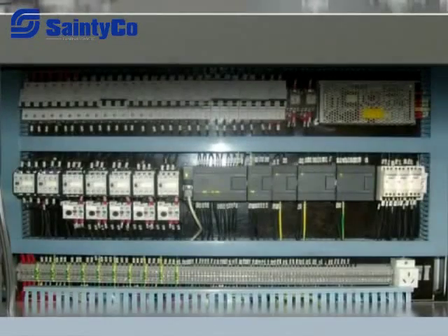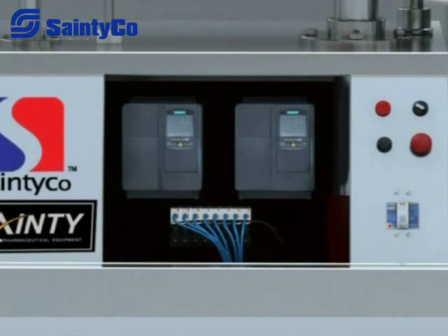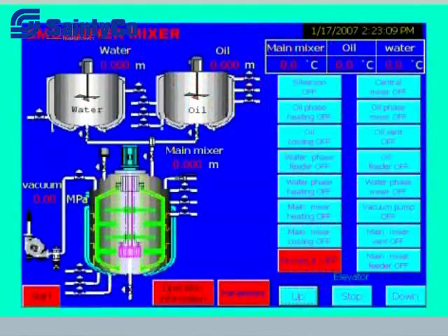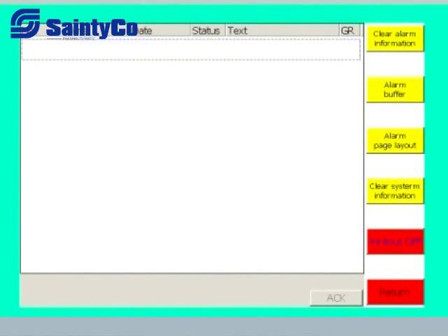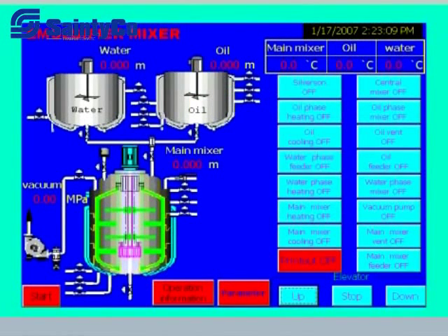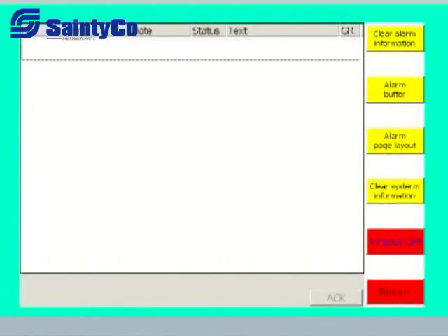7. Electric control system. It is made up of PLC, circuit breaker, heat protector, touch screen, frequency converter, temperature transducer, and electromagnetic valve. The touch screen displays the control screen, parameter set screen, parameter updating screen, temperature curve screen, warning screen, and password protection. On the function screen, any screen can be accessed and any function controlled. Parameters can be easily changed from the parameter setting screen. Other parameters and functions displayed in the HMI include review of current parameters, temperature of the tank, alarm record, and plotting of time-temperature curves.